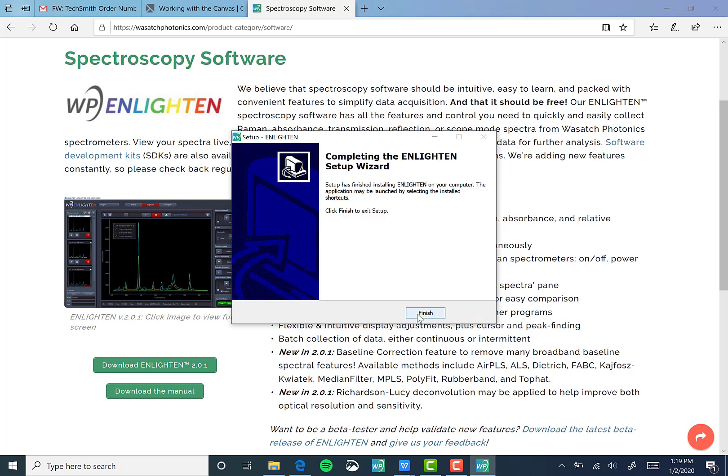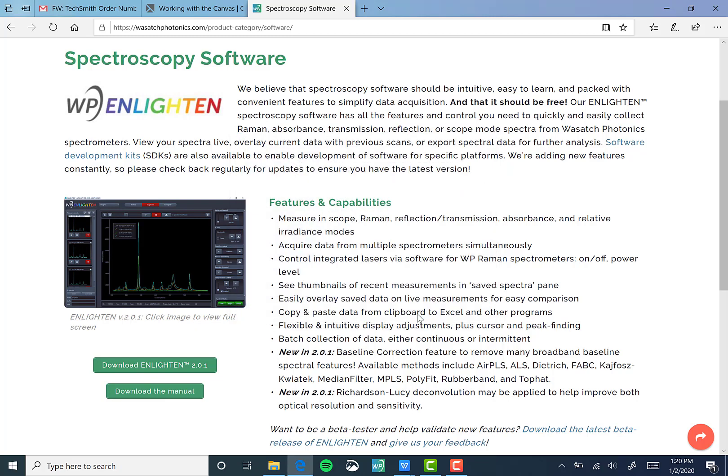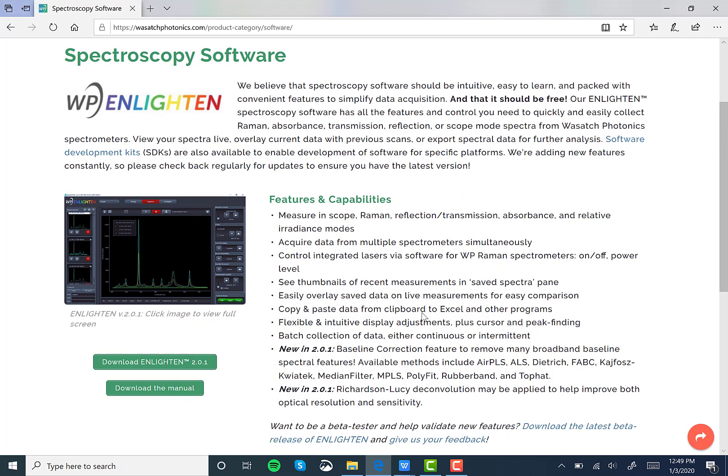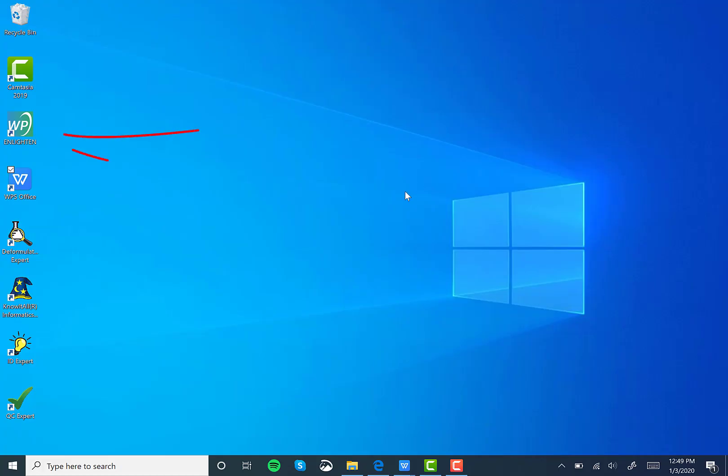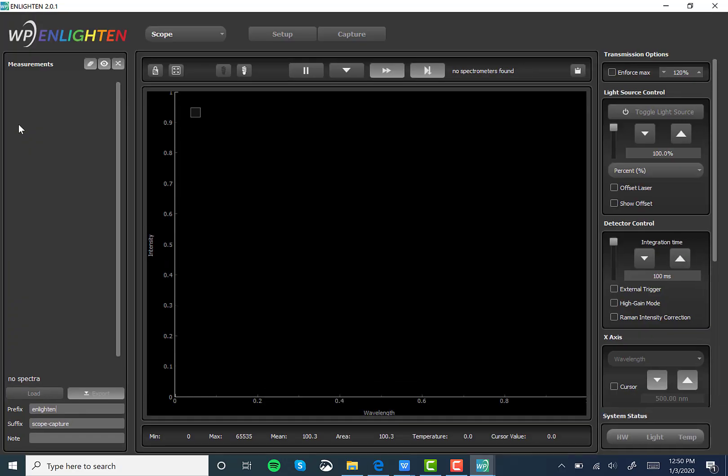Now that you've finished with the installation wizard, go ahead and click finish. If you aren't already prompted after this window has closed to launch the software, go ahead and minimize all the windows that you have so that you can view your desktop. Double-click the Wasatch Photonics Enlighten icon denoted by the red arrow and you will have launched Enlighten version 2.0.1.